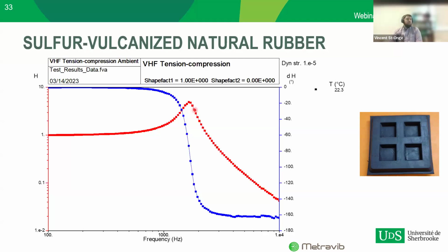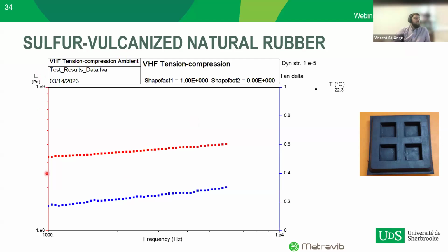And from that, when we did the modeling, we ended up getting the mechanical modulus of the sample as well as the tan delta curve, as you see here in blue. And it's perfectly in the range of what was expected. Over the valid range that we had, we can see a modulus that is nearly perfectly flat. And we see a tan delta curve, which is between 0.2 and 0.3, which is close to what was expected for the material. So it works quite well for a natural rubber.